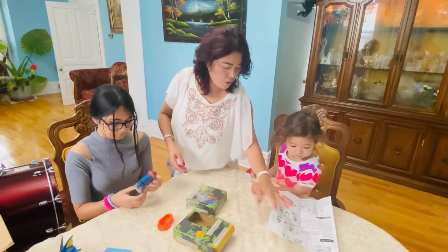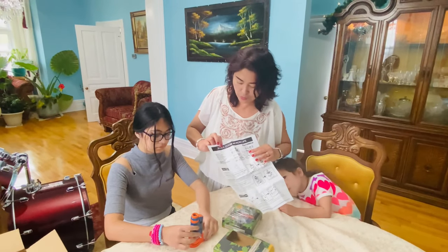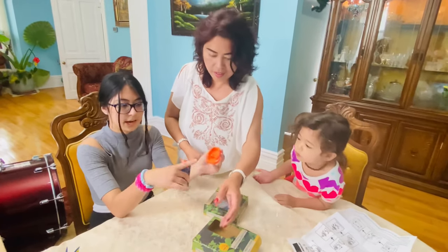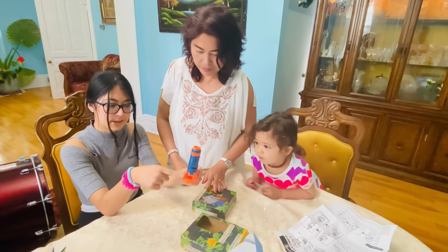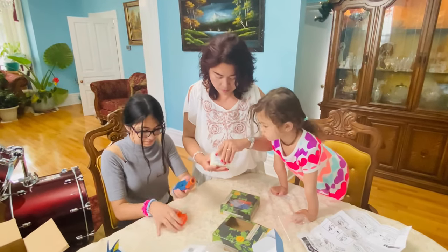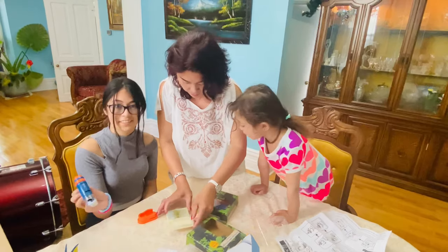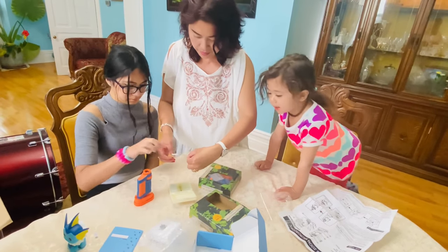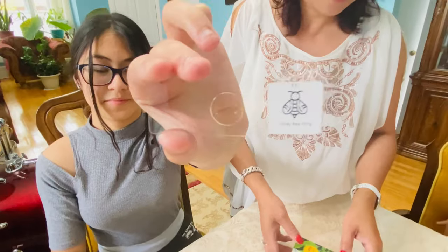If you don't know how to use it, there's a manual. This is 20x to 40x magnification. This is the base where you put the slide underneath. This is how you connect it — you look at the top and search at the bottom. Which one are you going to look at? Just the mosquito? There's a light too. How about the honeybee wing? I like mosquitoes, mom!